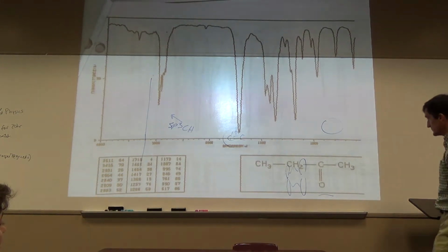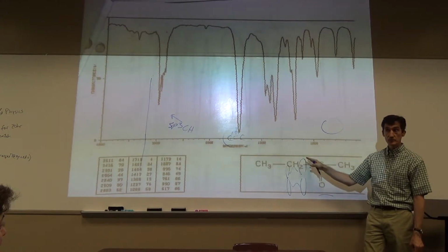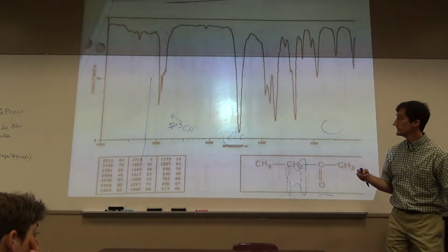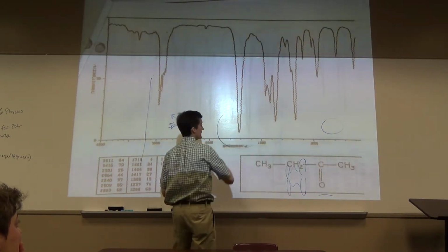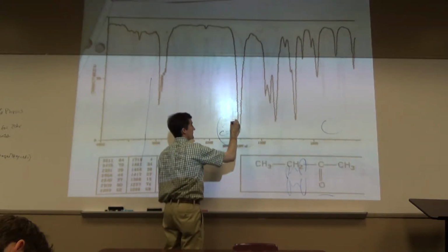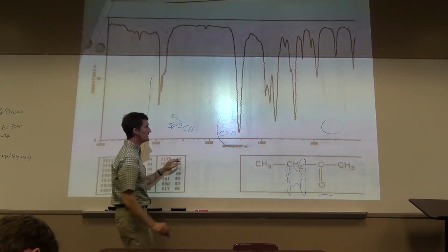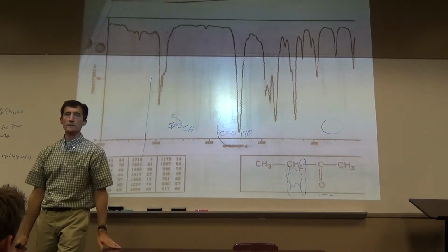Okay, what functional group do we have here? Yeah, it has a carbonyl, but the functional group is called a ketone. Where does carbonyl give a peak at in the IR? 1650 to 1800. Okay, this is sort of carbonyl region right here. And there you go. And the exact value is, what's that, 1718? Very middle of the road carbonyl.